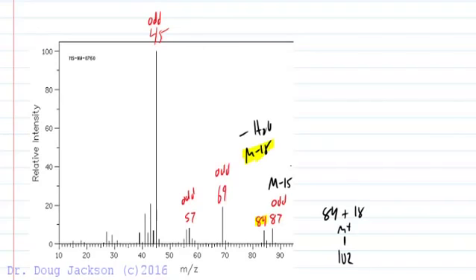And again, the way we could tell is because of the odd fragments and the even peak that's not high enough to be the molecular ion. To be a molecular ion, you've got to be the highest mass, not due to isotopes, and give reasonable fragments.